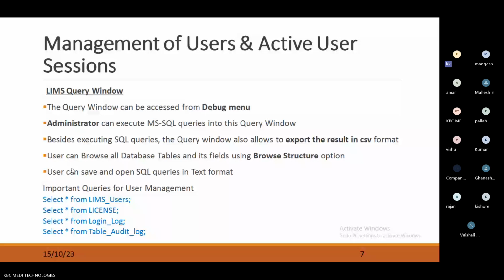Some people will say, I am going to maintain user ID control through a LIMS manual password. Some may say, I want to use an LDAP password: whatever desktop password I maintain should also apply to the LIMS application. The system allows it that way.